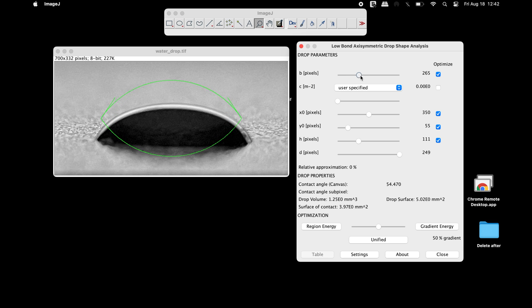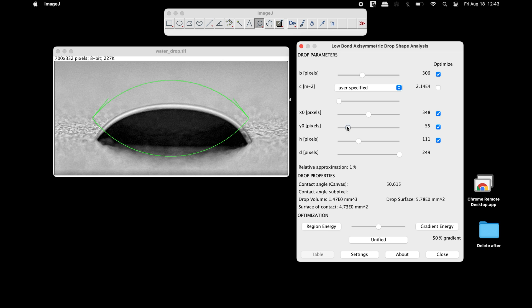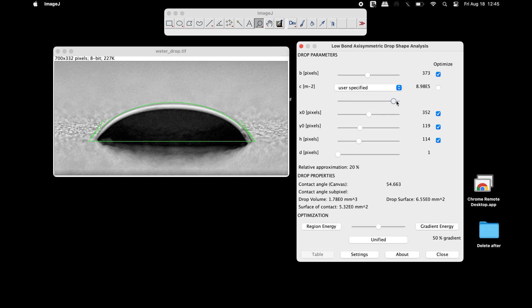Using the sliders, adjust the drop parameters. Use the B parameter to resize the fitting. To move the fitting left or right, adjust the X-zero slider. To move the fitting to the bottom, adjust the Y-zero slider. Use both the H and D sliders to align the flat surface of the drop. Once all parameters are adjusted, the contact angle is displayed — the contact angle of this water drop is 58.587 degrees.